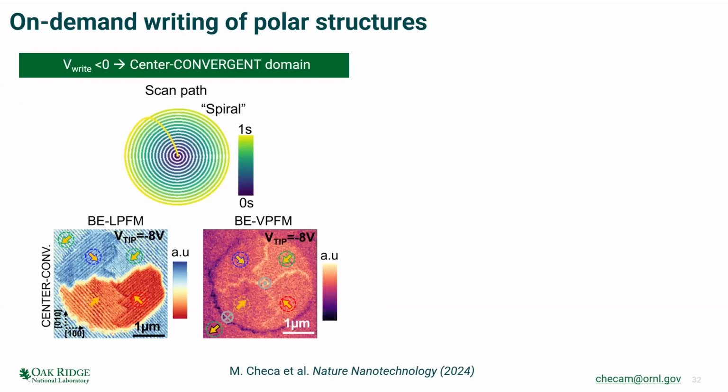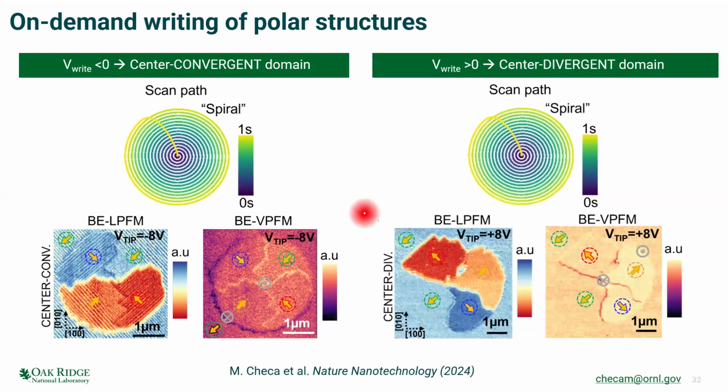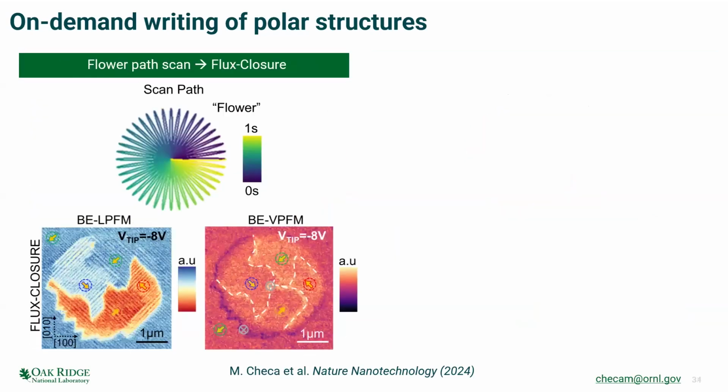Good question. So here we have bright because we have head-to-head. Here we have dark because we have tail-to-tail. Now in the center, we have tail-to-tail, so we have dark. And then in here, it's hard to see with this color scale, but we have a little bright because the underlying is head and this is head. So then what you're asking me is when you do the flower, right? Here, you don't really have head-to-head, and I still see some sort of lighting, right?